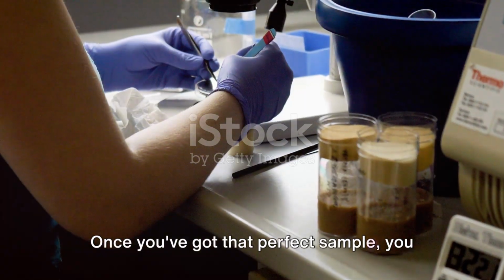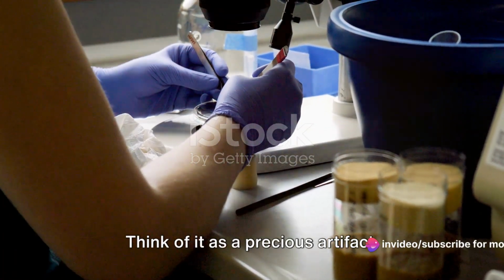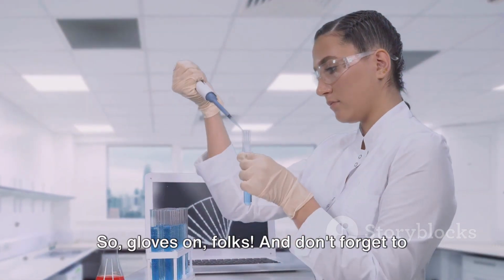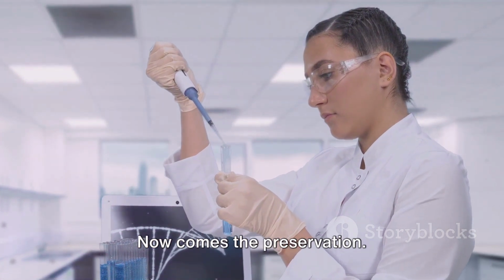Once you've got that perfect sample, you need to handle it with care. Think of it as a precious artifact. Any contamination can skew the results and lead you astray, so gloves on, folks, and don't forget to clean your equipment thoroughly. Now comes the preservation.